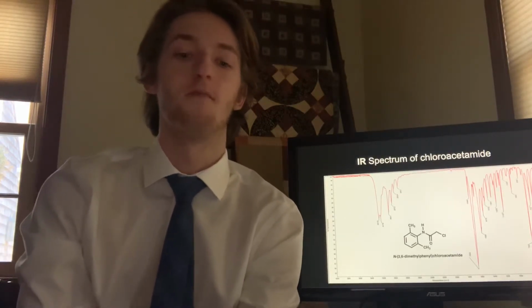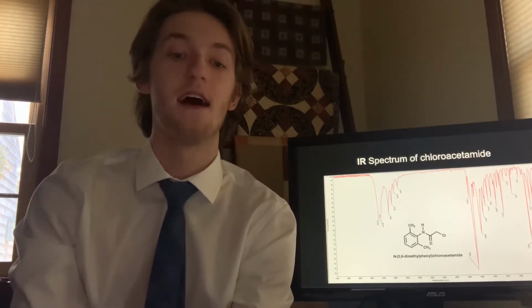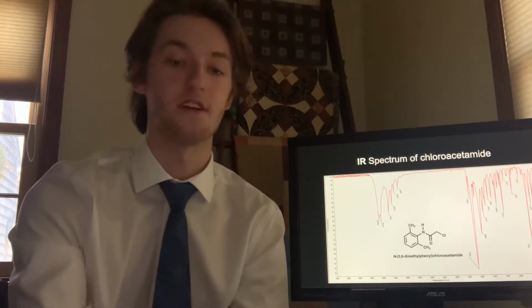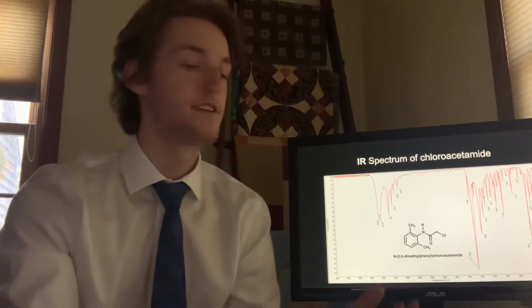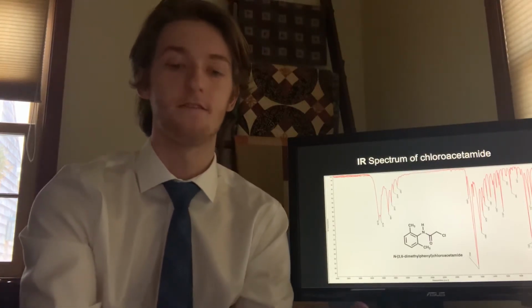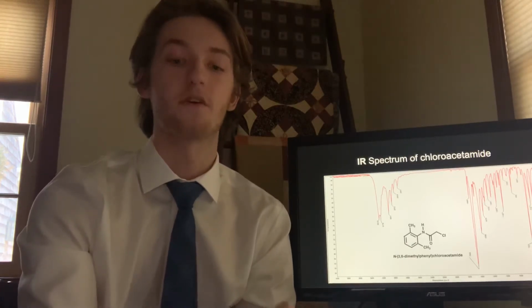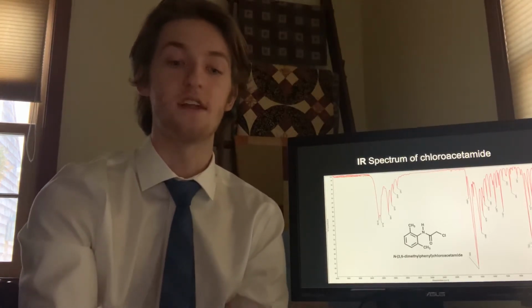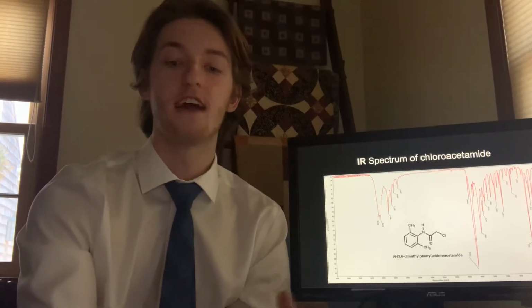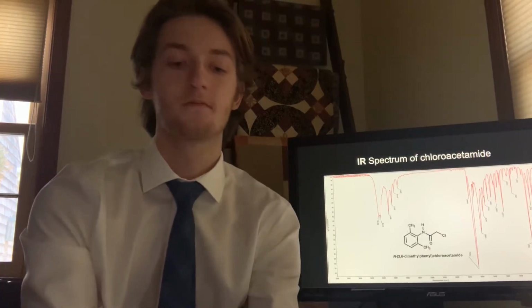The IR spectrum of chloroacetamide is enough to explore both the IR of chloroacetamide and lidocaine because they are very similar in the functional groups that are active on the spectra. IR is described as an analytical method that provides useful information respecting the functional groups of a compound. The functional groups of chloroacetamide that will give positive signals through IR are the secondary amide, the sp2 CH phenyl ring, the sp3 alkyl group, and the C=O of amide.